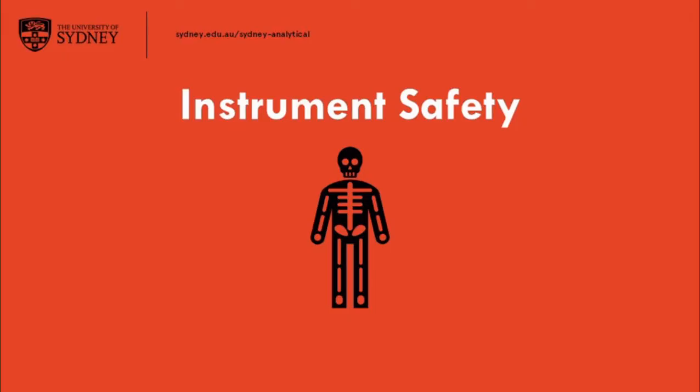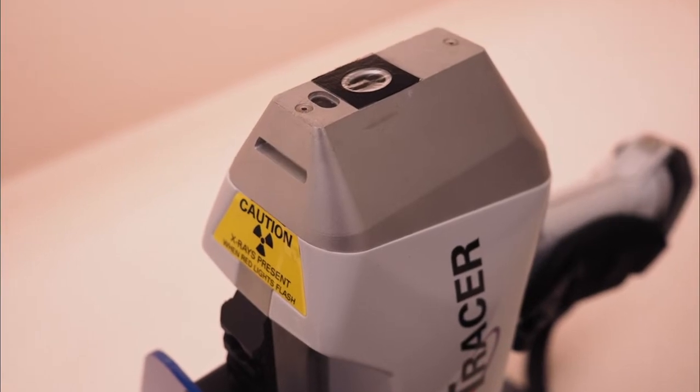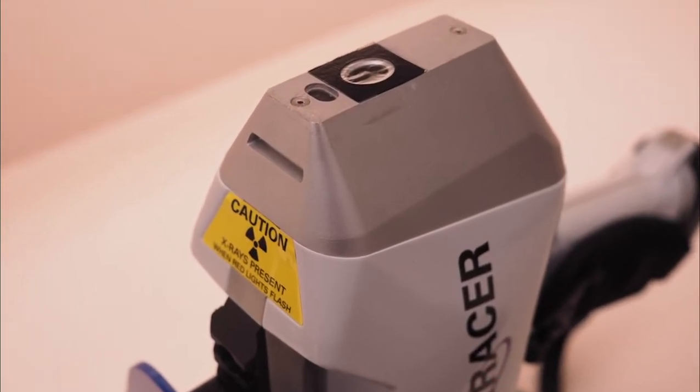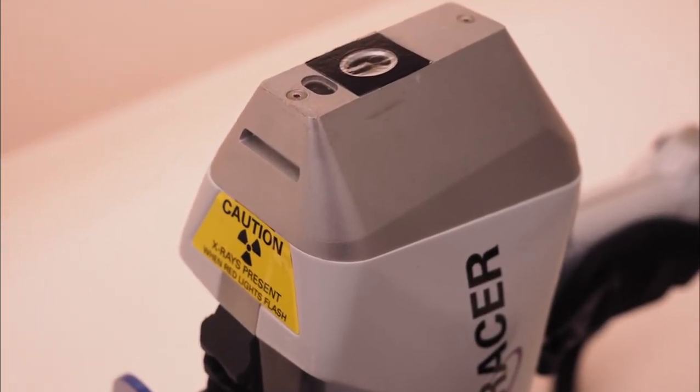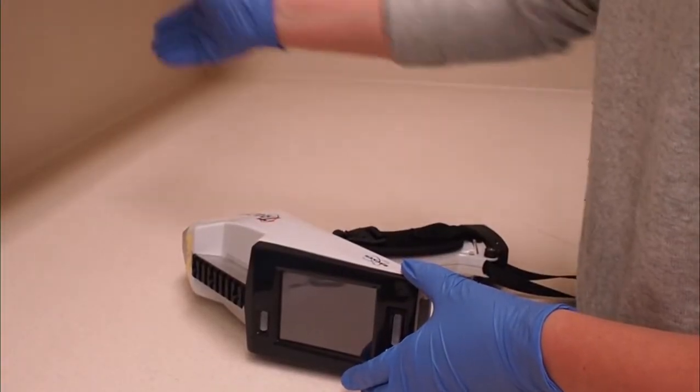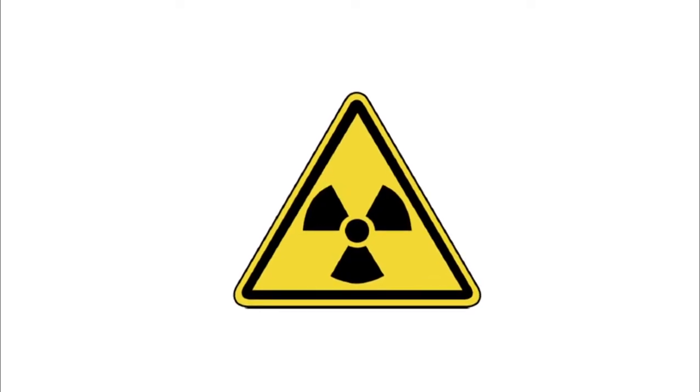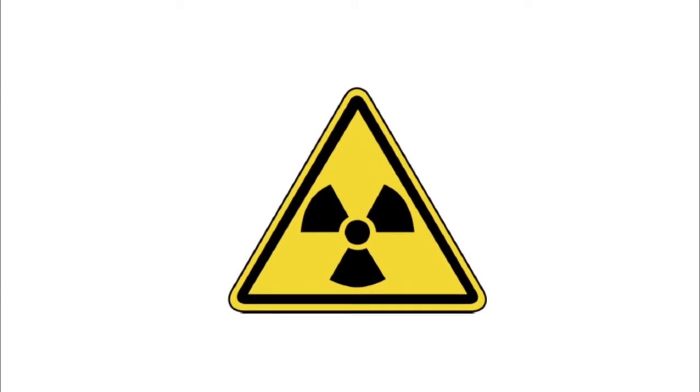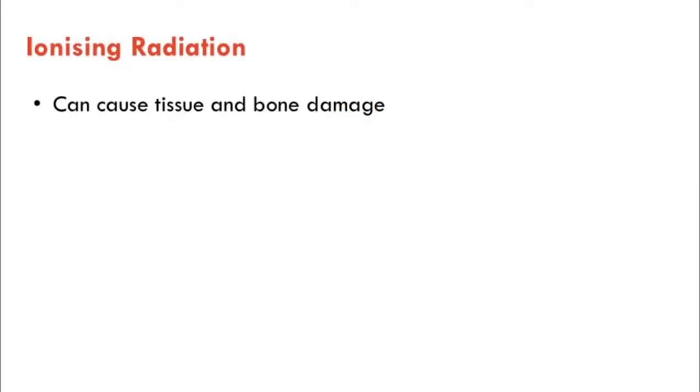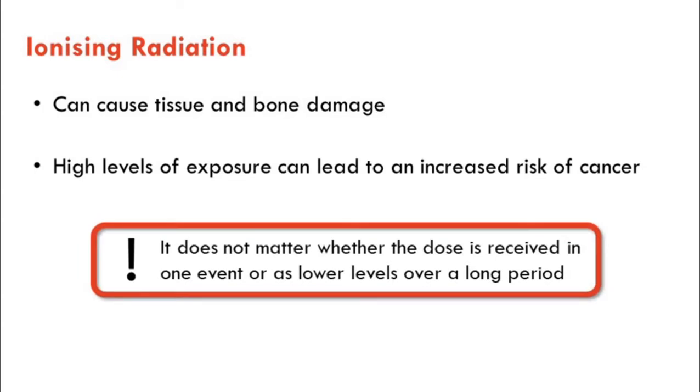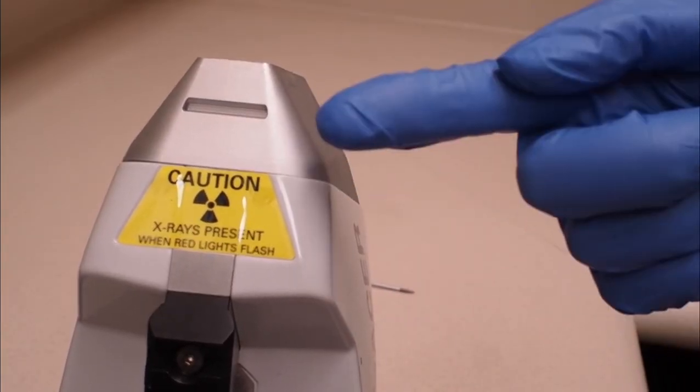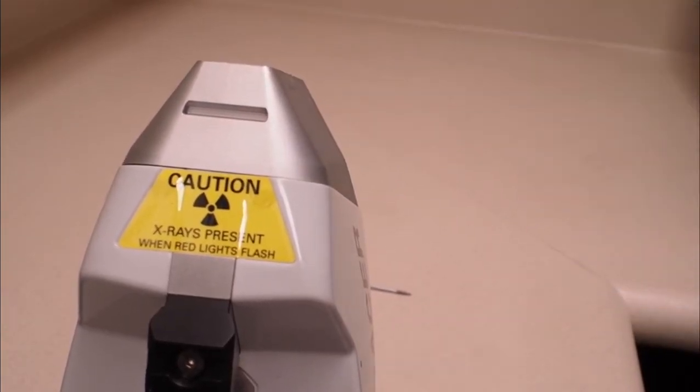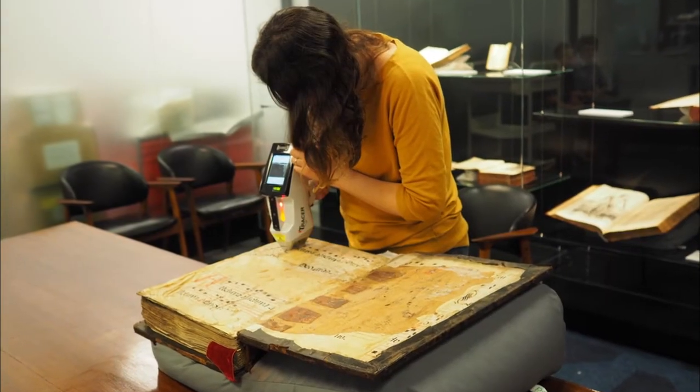Instrument safety. The most important thing to consider when operating the tracer is radiation safety. When in use and X-rays are being emitted, there is the potential to be exposed to ionising radiation. Ionising radiation can cause tissue and bone damage, with high levels of exposure leading to an increased risk of cancer, whether the dose is received in one event or received as lower levels over a long period. As a result, several safety measures have been put in place, whether in the laboratory or in the field.